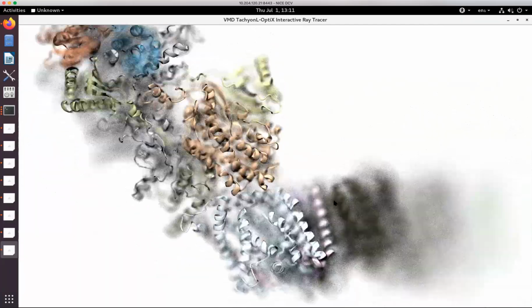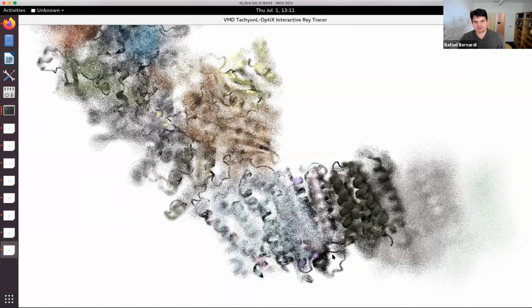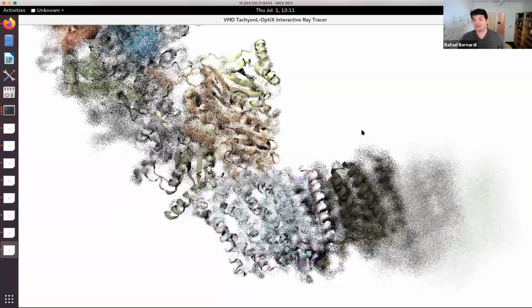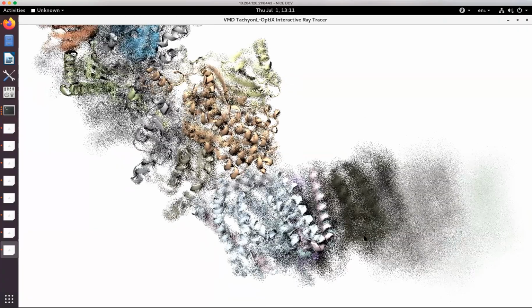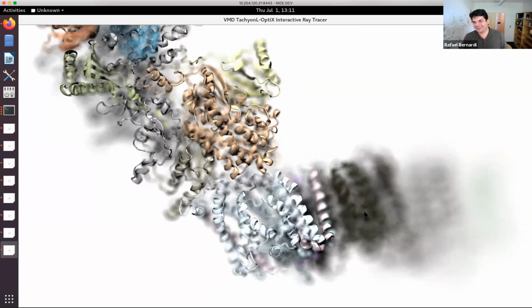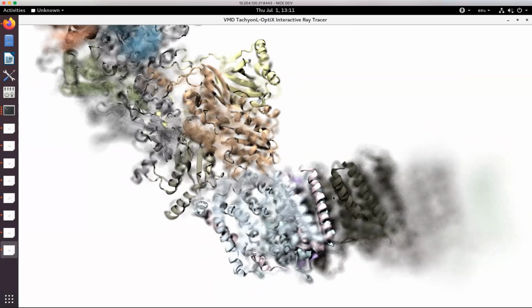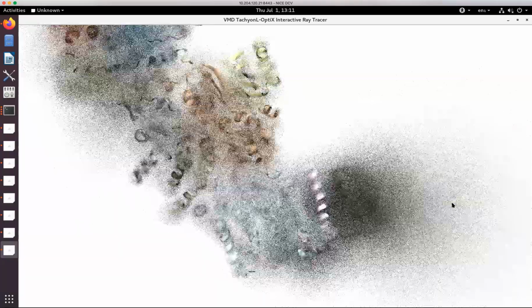And then as far as the focal point goes, you can move it either with the arrow keys or with the mouse, using the F key with the mouse. Yeah, you can move it up and down with the mouse like this. I'm clicking to do it. Which one is better sort of depends on how fast the GPU is. I like the mouse, but I also have a pretty fast GPU, so for me it's fast enough. It doesn't matter.